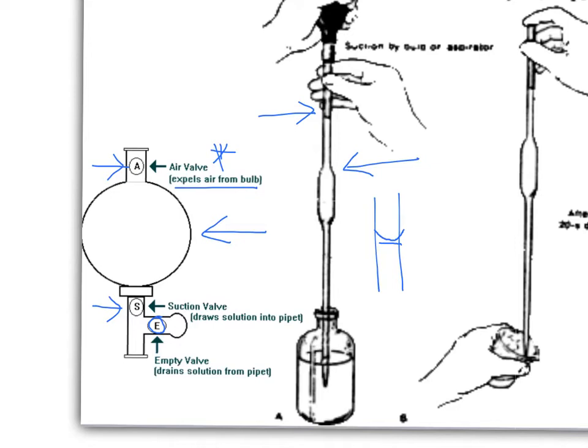Then you're going to put the bulb onto the pipette. So the pipette is going to stick on here and you must stop well before you get to S or the side thing, otherwise you're going to push that bead into the bulb. So you only want it on so that it's firm but not too far on that it's going to hit that area S.